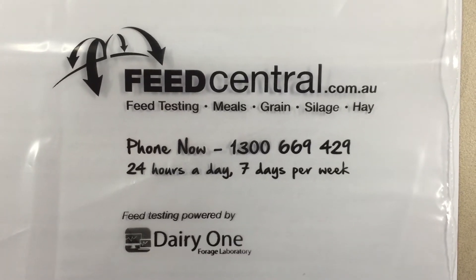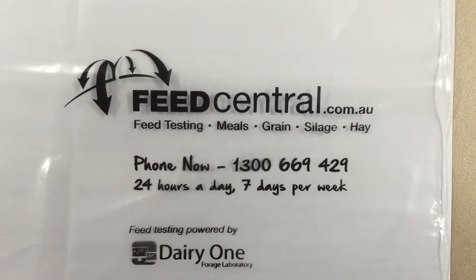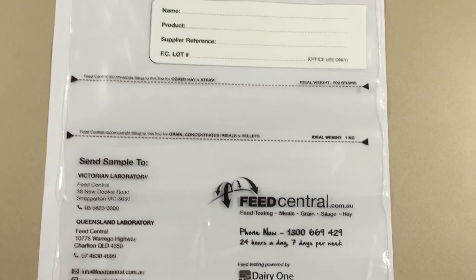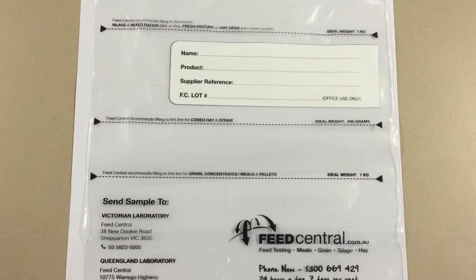G'day, Ian here from Feedcentral again. One of the most common questions we get is: how big a sample do you require if I'm going to send a sample to your lab?